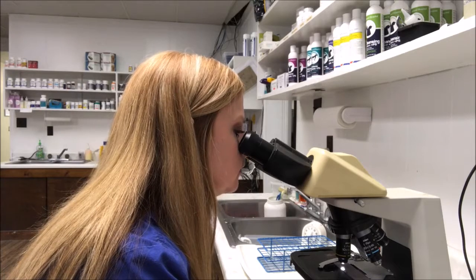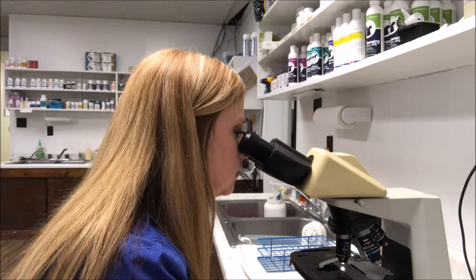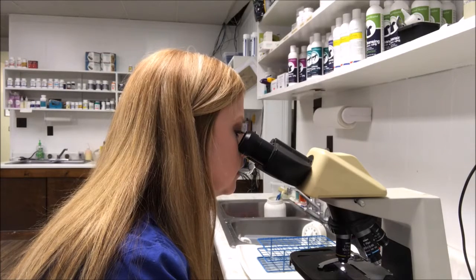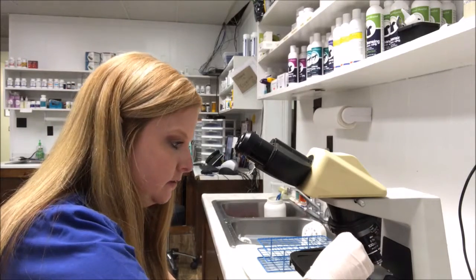Got some cells here. Very good example, so I'm going to go on down to 40x.